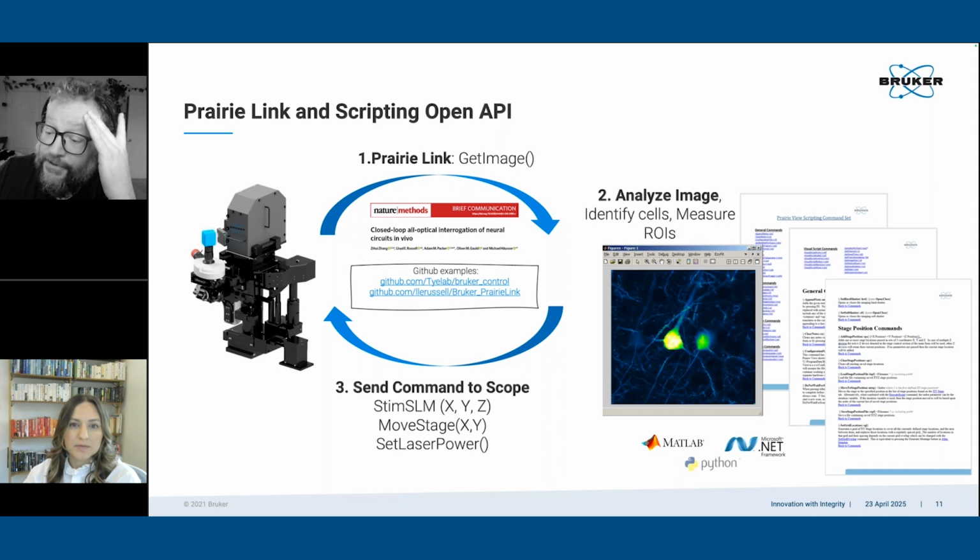Yeah, good question. The easy way to do this sort of thing is synchronization with a behavioral setup, and that would be just TTL pulse synchronization. So the system that defines your hologram can essentially wait, and let's say your mouse licks the sugar port or whatever, and your behavioral apparatus is set to trigger optostim anytime the mouse licks.